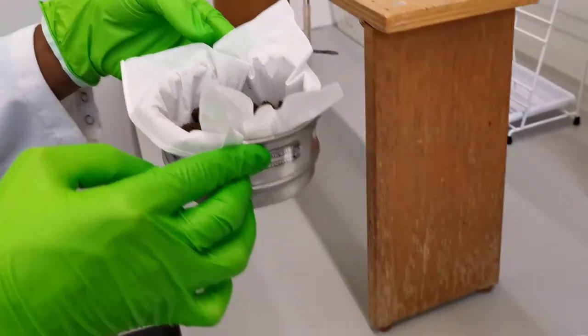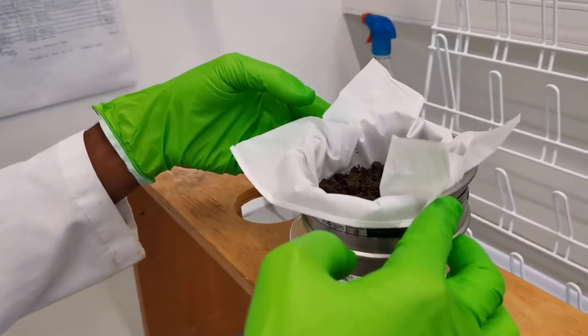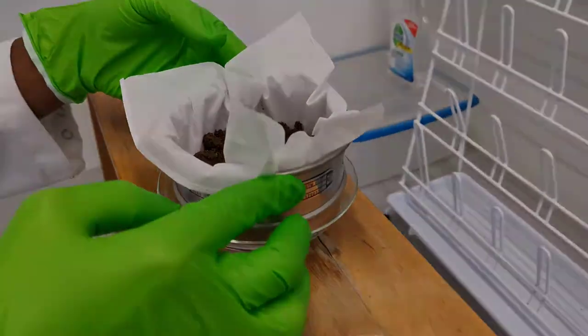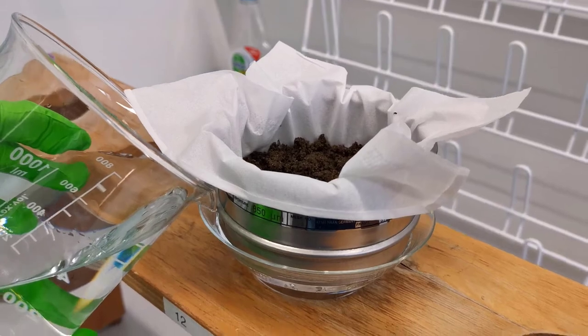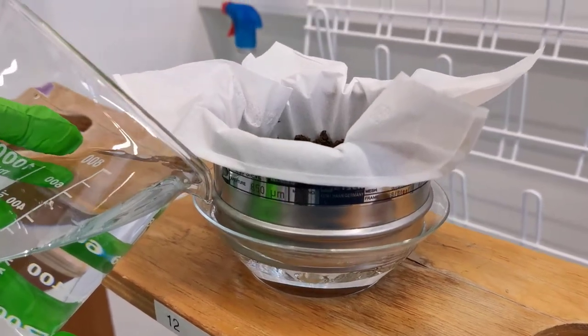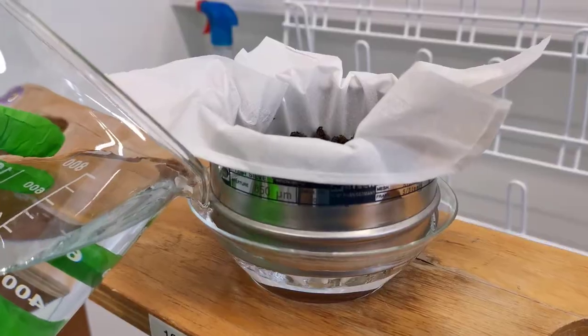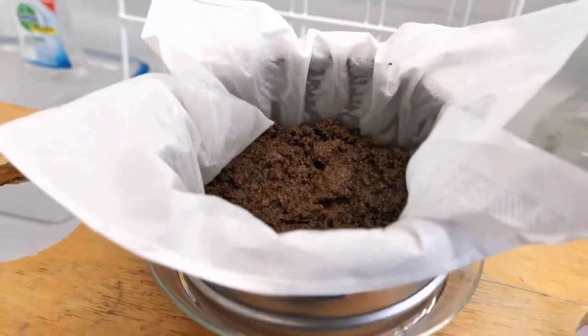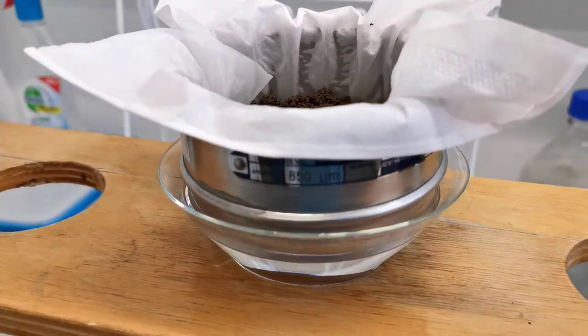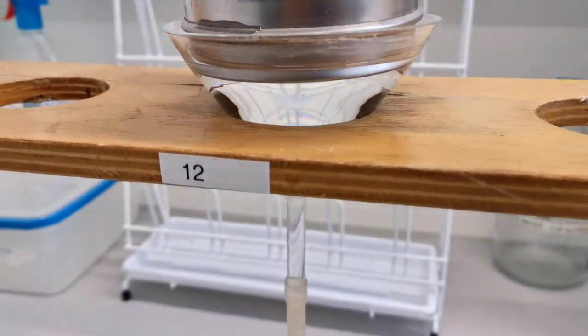Carefully transfer the sieve containing the soil or plant material onto the funnel and add water into the funnel such that the water slightly touches the soil or the plant material. You could also choose to cut off extra ends of the tissue paper to avoid fast wicking away of water.